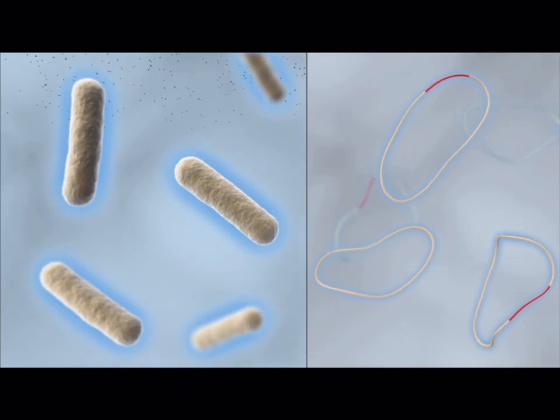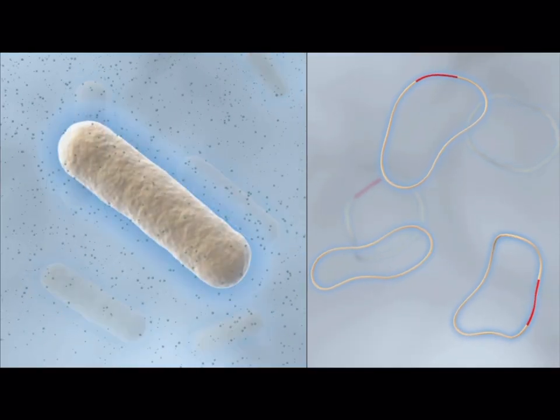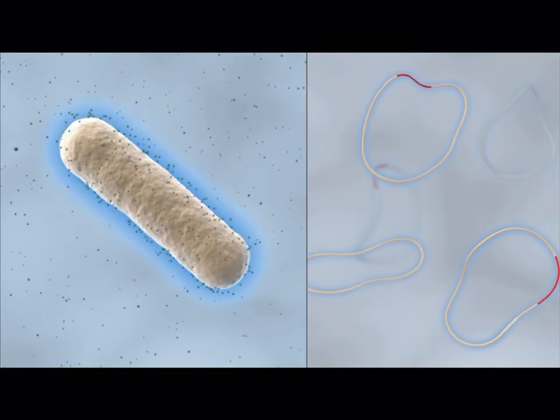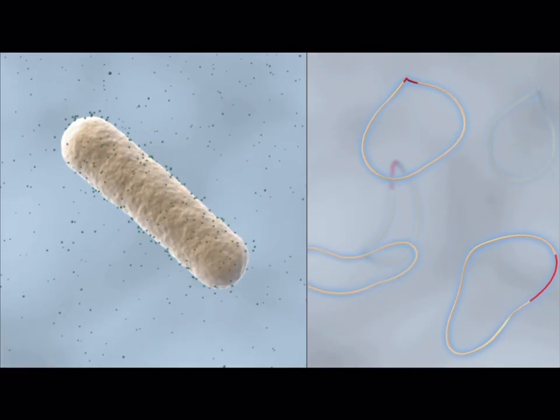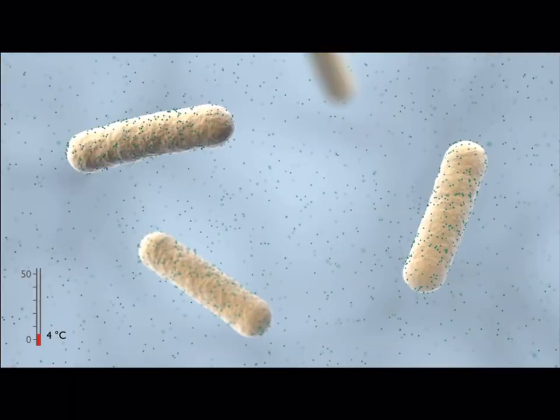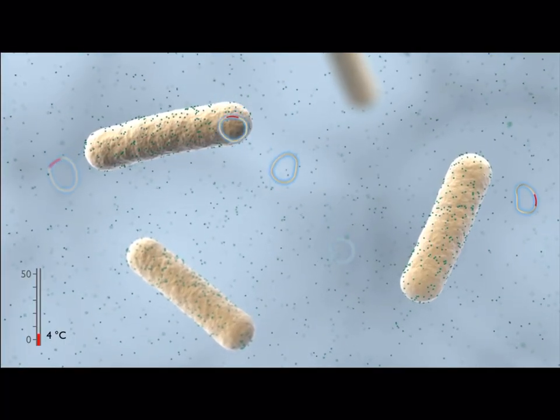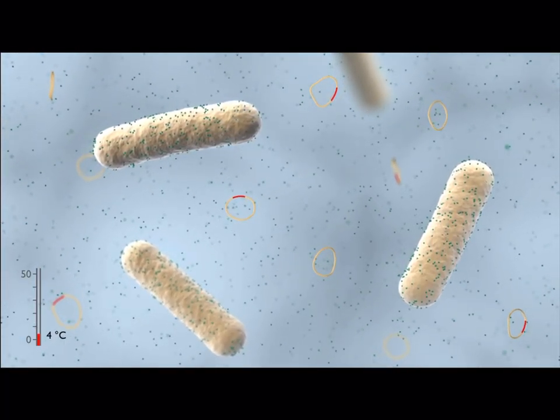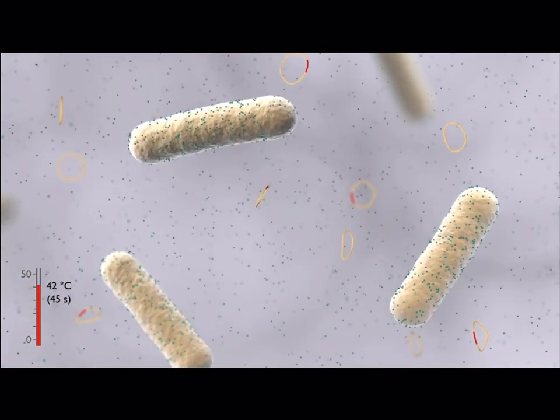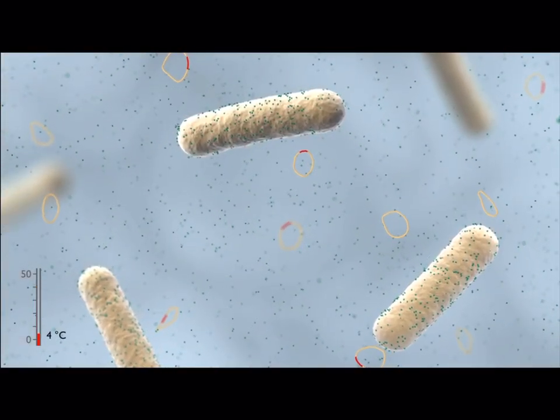To facilitate this interaction, calcium chloride is mixed in with the bacterial cells. Once in solution, the positively charged calcium ions bind to the negatively charged phosphate groups on the cell surface and neutralize their charge. Plasmids containing the gene of interest are then mixed with the treated cells at 4 degrees Celsius. The temperature is quickly increased to 42 degrees Celsius, and then reduced back to 4 degrees Celsius.